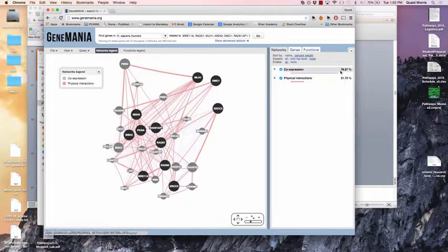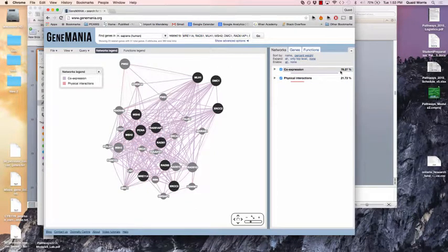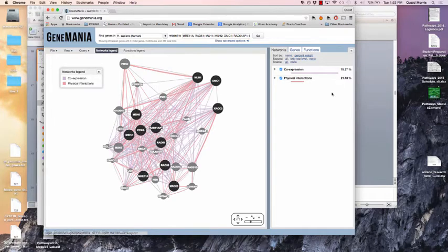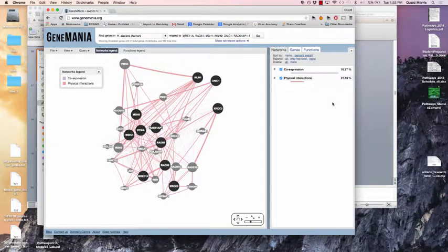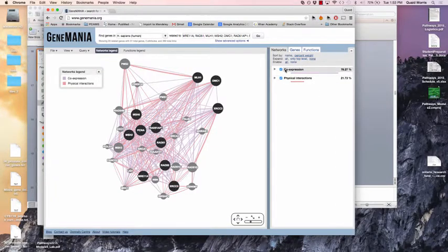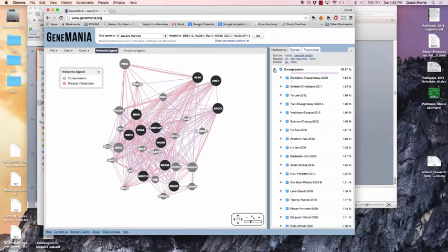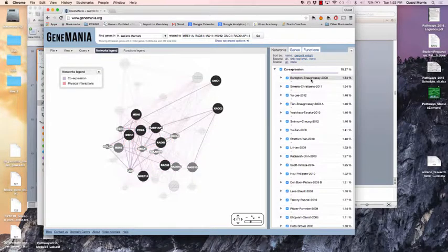Here we see the relative weights assigned to the different data sources. Co-expression gets about eighty percent of the weight and physical interactions get about twenty percent of the weight. We can look down to see the weights.